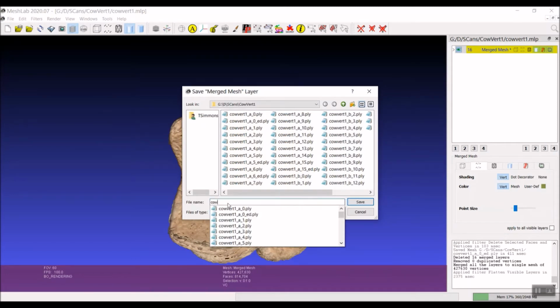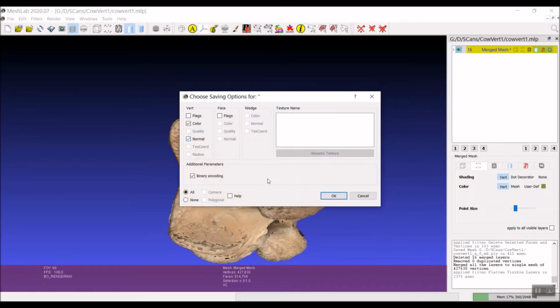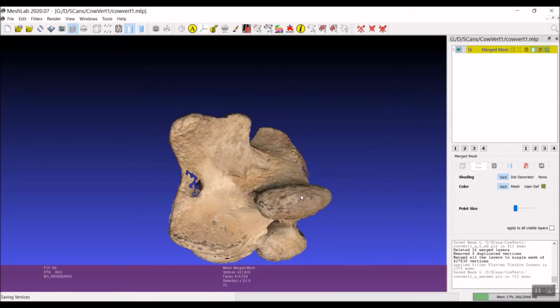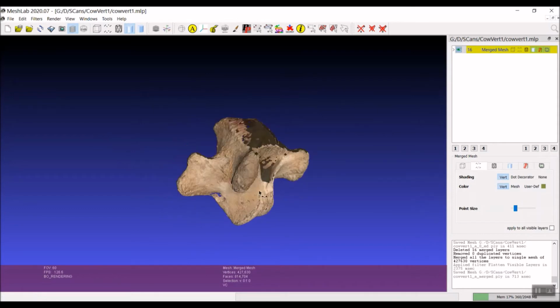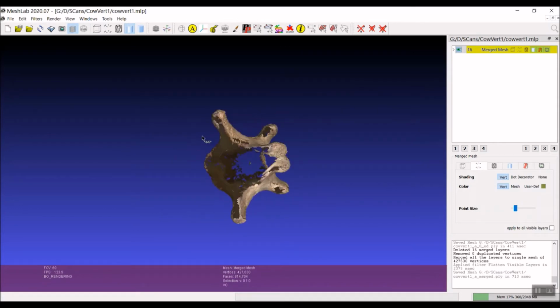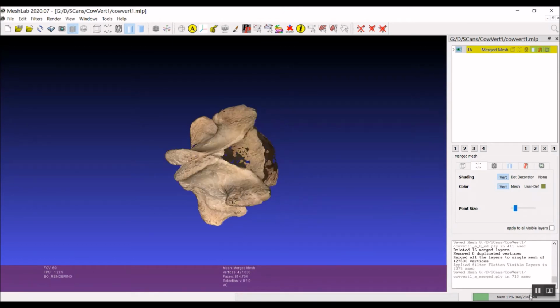as, I'm going to call it merged. And you'll notice we don't have anything on the superior and inferior surfaces because that would be scan family B. So now I need to work on that.